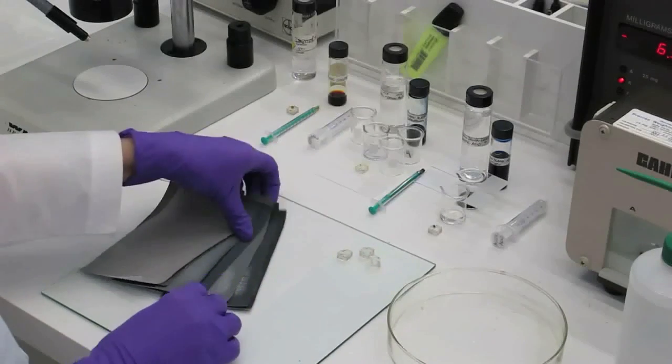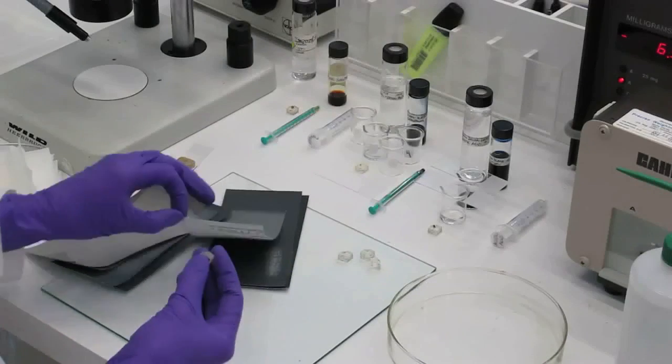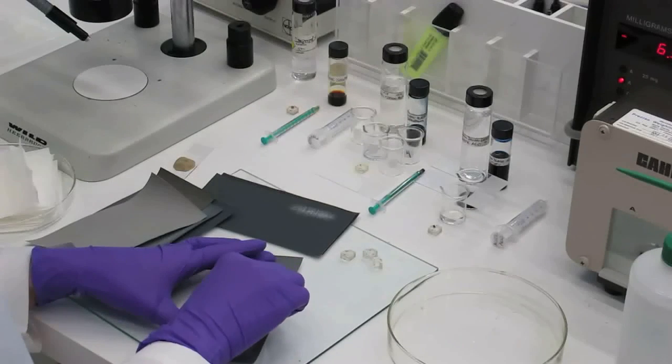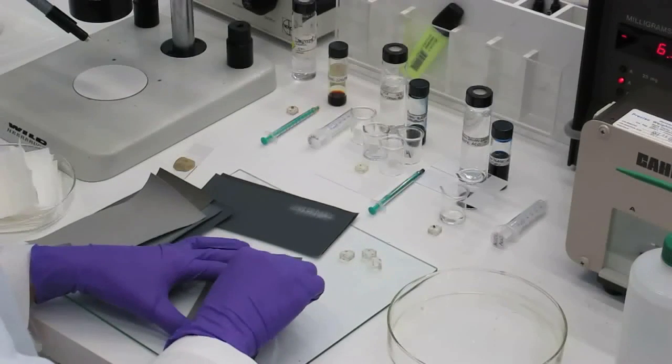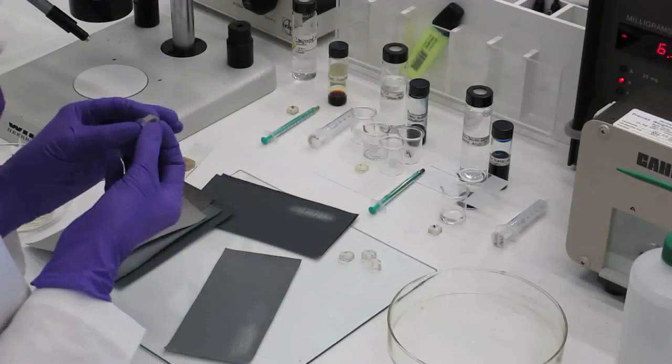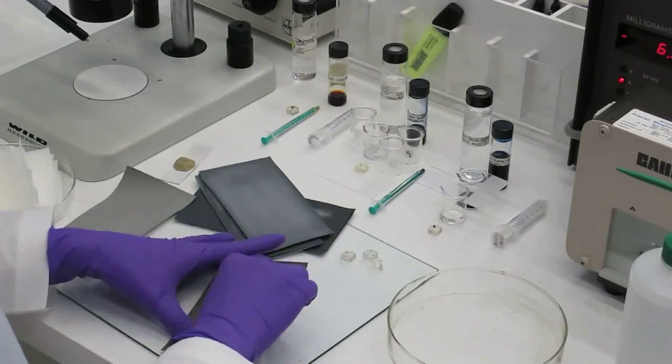To make sure that the sample has a perfectly smooth cross-section surface and is clean without any fingerprints or other contamination on it, it is useful to repolish the sample just before starting the staining procedure. For this purpose, the finest grades of micro-mesh with grids of around 6,000 to 12,000 are used.